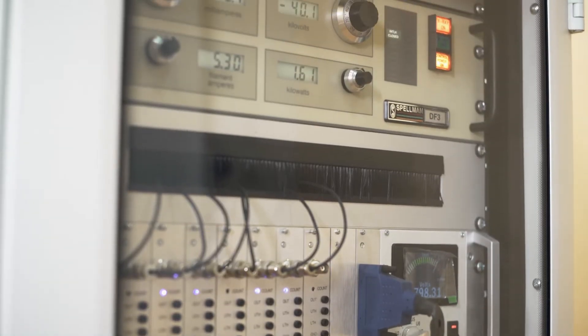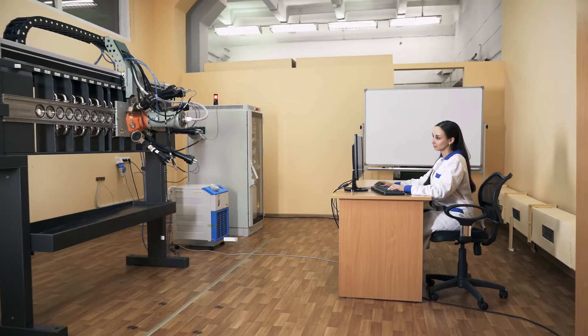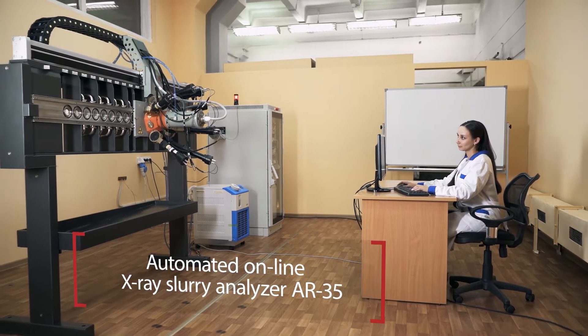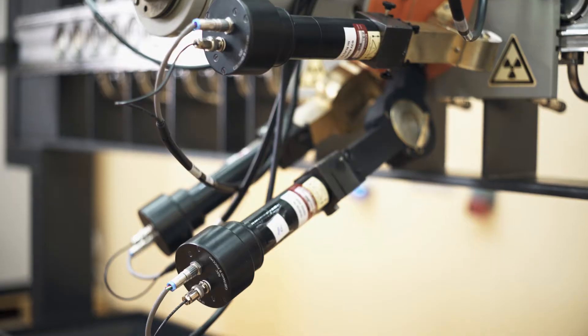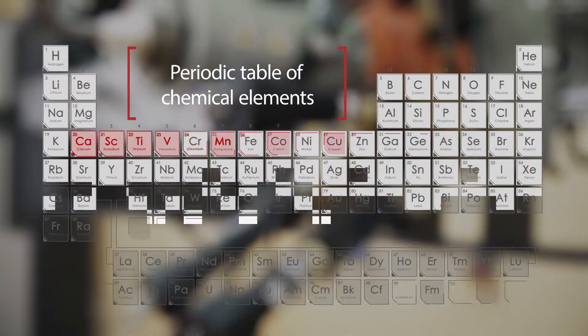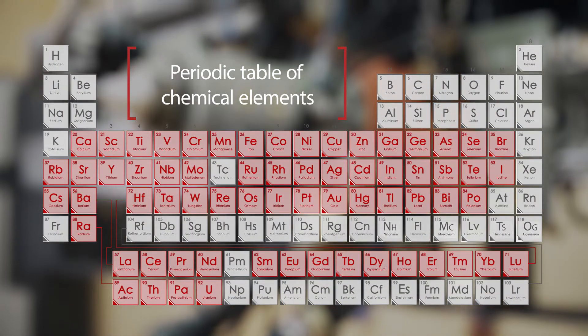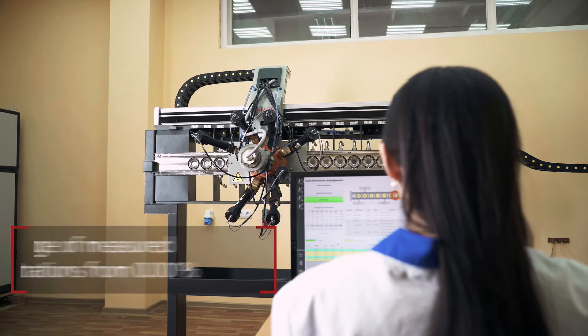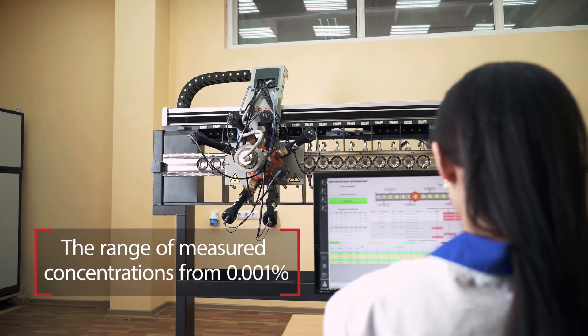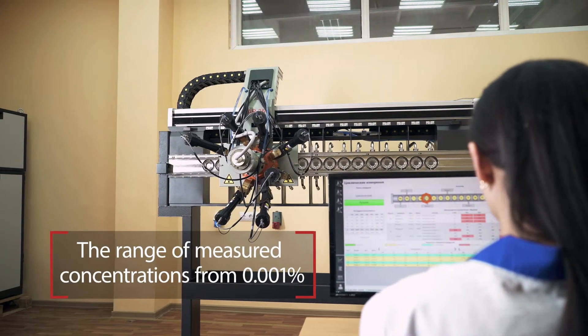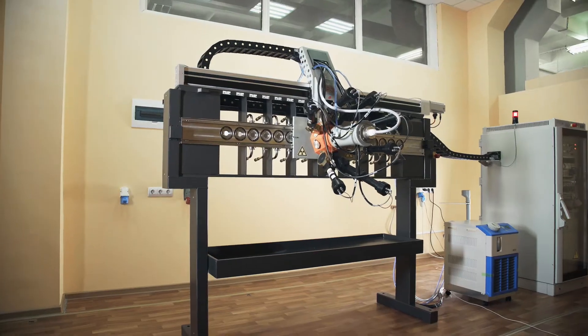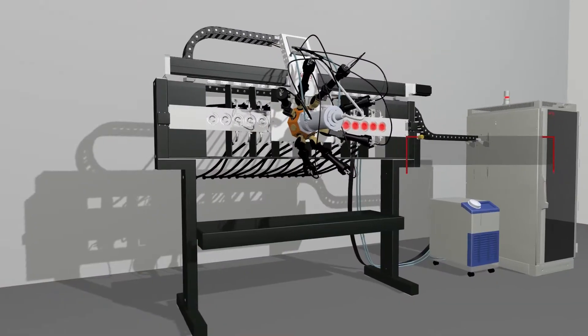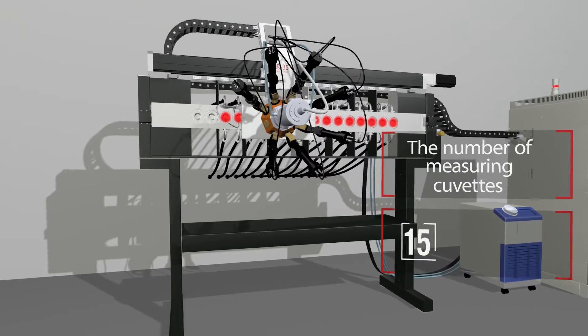The x-ray fluorescence on-stream analyzer AR-35 has been developed for continuous analysis of pulp and slurry flows over a range of determined chemical elements from calcium to uranium. The AR-35 can analyze up to seven elements per flow stream simultaneously for concentrations of 0.001 percent and up. The basic configuration contains 15 flow cells, but this number can be reduced to ten or six streams on the customer's request.